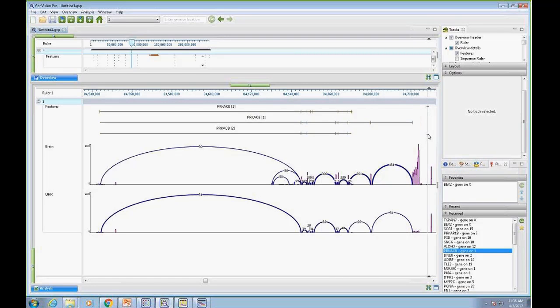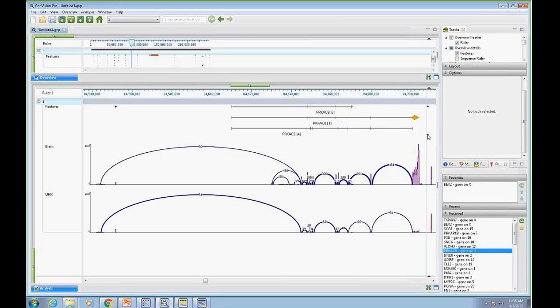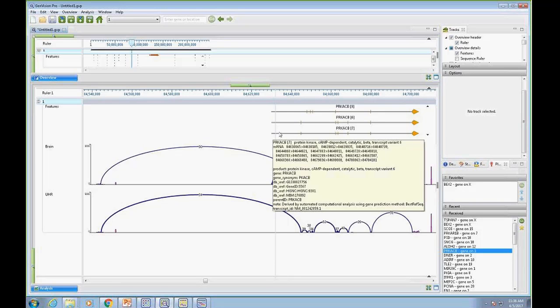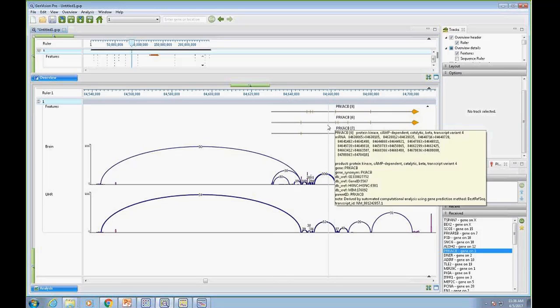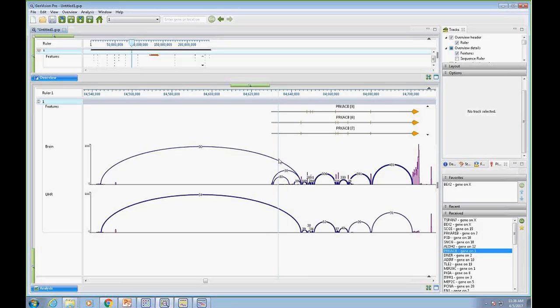Now this gene has, so I'm looking again up at these annotations, and I'm looking for, are there tick marks? And there I can see the start point. There's a whole subset of isoforms here that have an alternate start site. So it looks like in this case in the brain we have those isoforms present, but not in the universal reference.